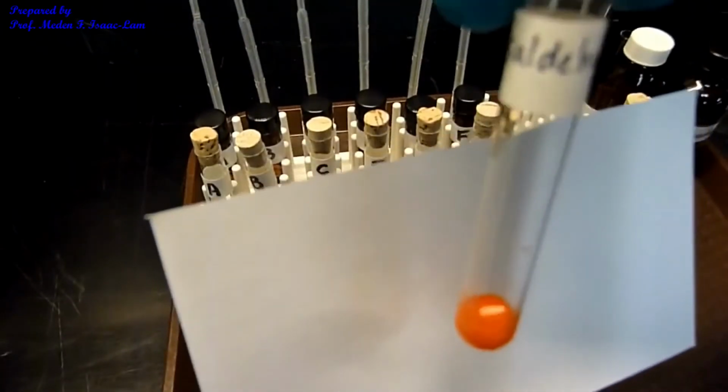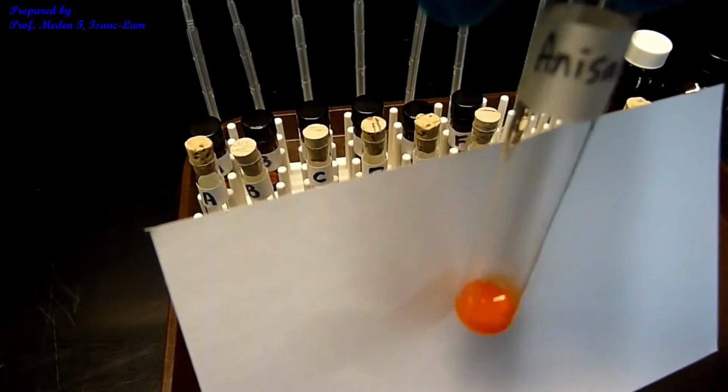So this is now the anisaldehyde standard, and it's a dark orange precipitate. It's actually the color of pumpkin or carrots. And then the 2-butanone also formed a precipitate at the bottom, although it's yellowish in color.